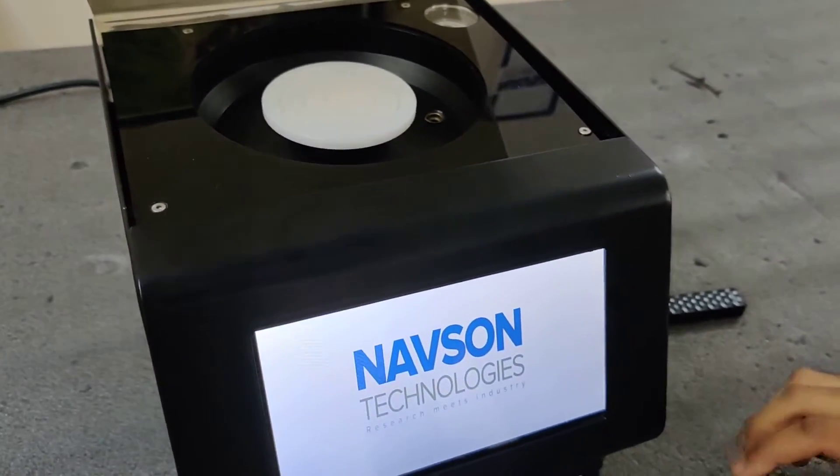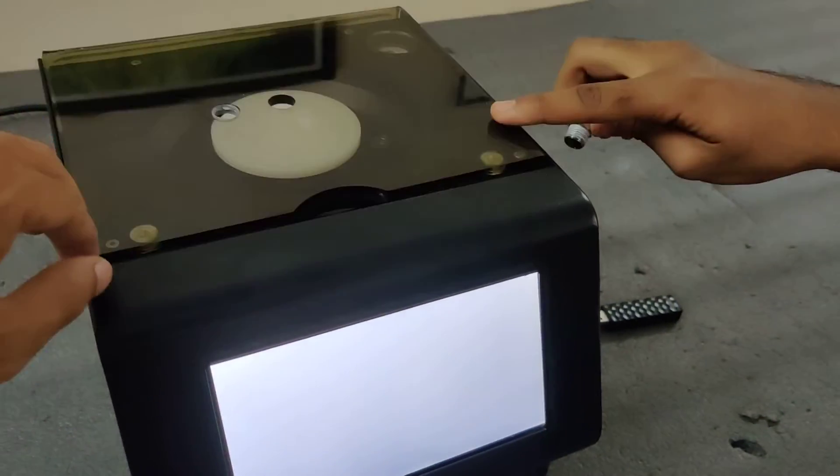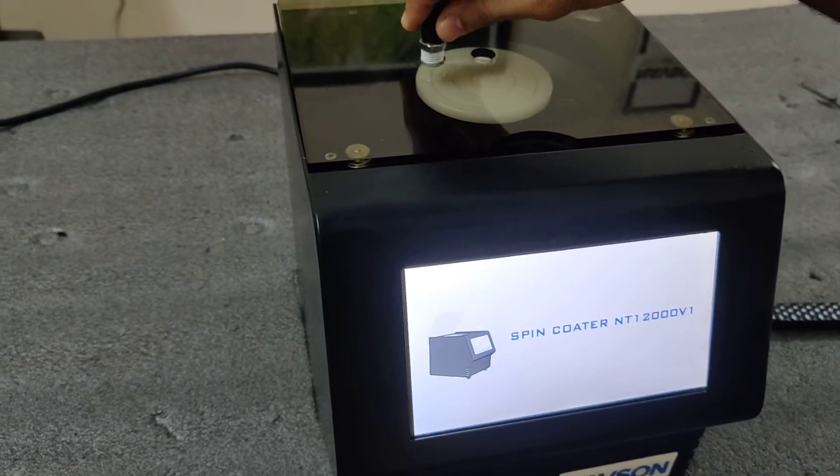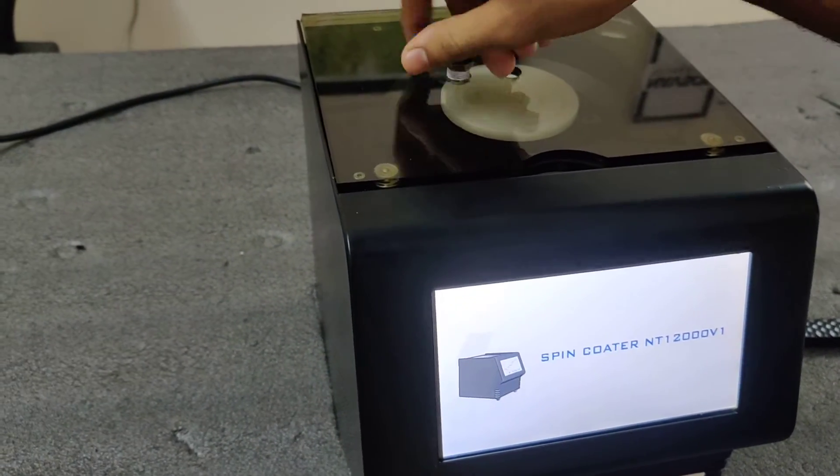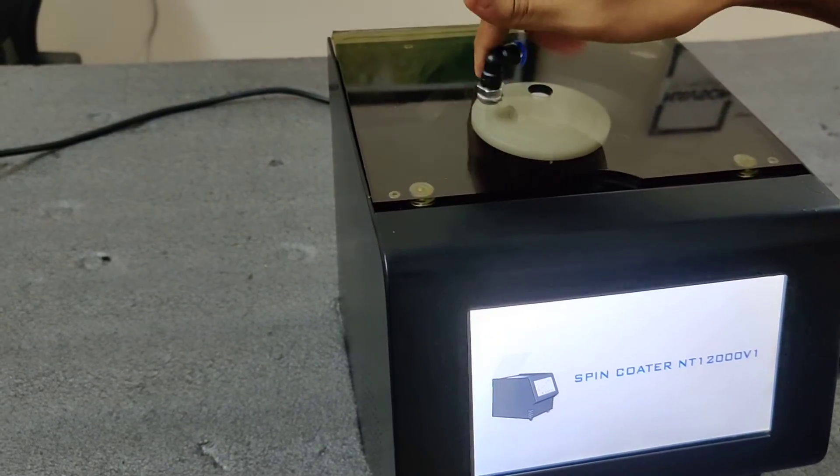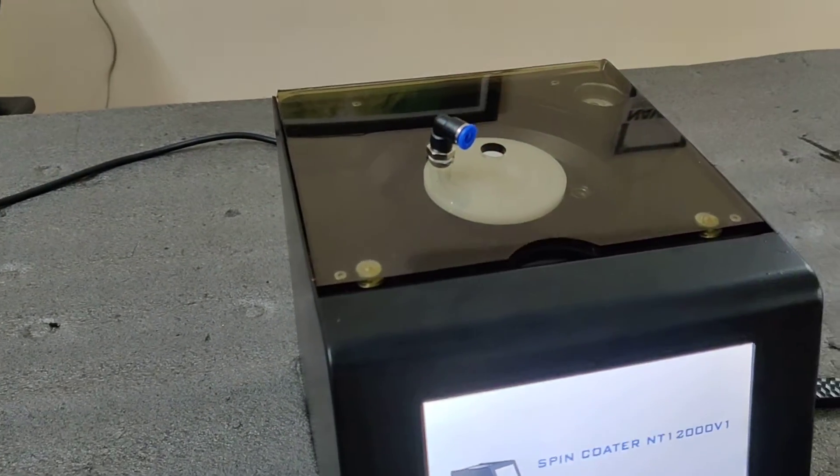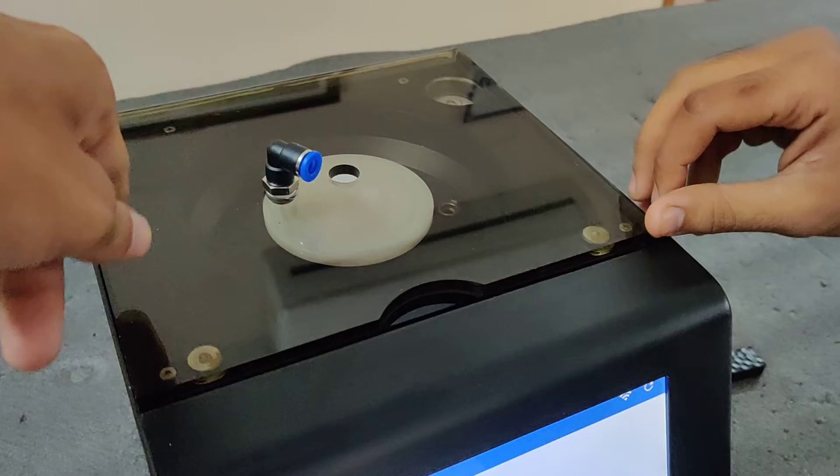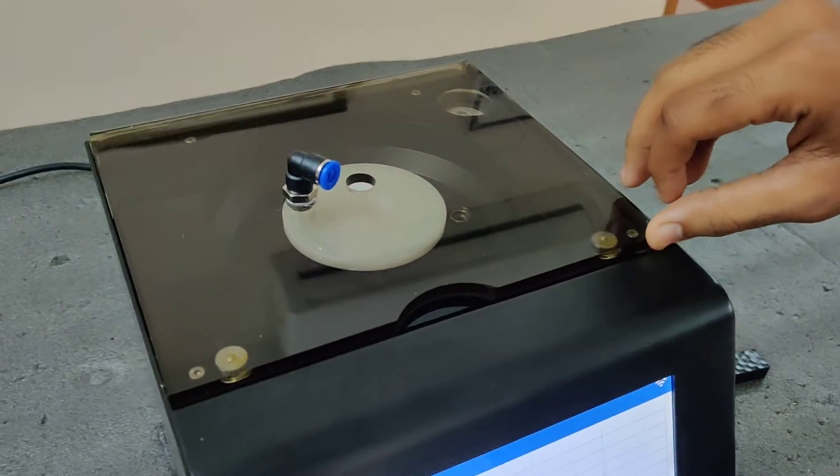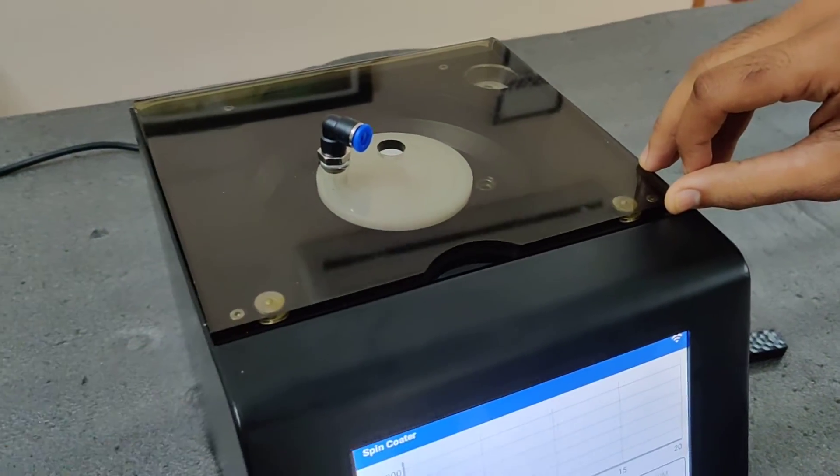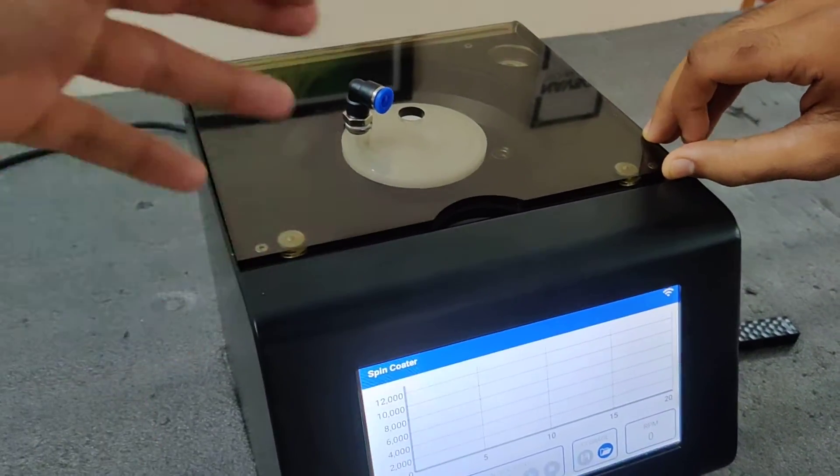And we have nitrogen purge. So if you want to pulse nitrogen, you can plug in this connector and use nitrogen purge. If you don't need it, you can remove it.